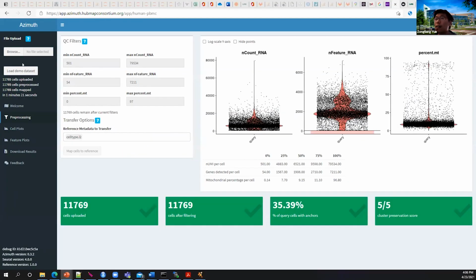So in this atlas, they provide multiple panels, but if you are interested and you have PBMC data, you can do this analysis. This specific panel is unique to the PBMC, so that will be regarded as the reference cluster, and you will upload your data to this website, and it will automatically generate the corresponding clusters with the cell types.